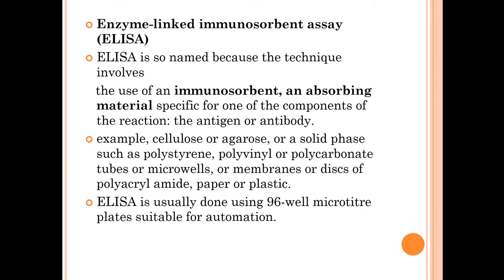Immuno is antigen or antibody, which is adsorbed on the material specific for one of the components, and therefore it is called immunosorbent. Assay is what? Quantitative estimation of any substance is called an assay. So therefore the word is enzyme-linked immunosorbent assay.